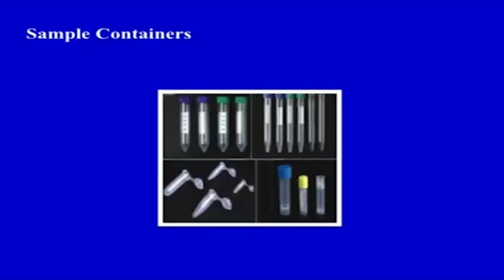All right. The sample containers which are used, like centrifuge tubes or bottles, are manufactured in a range of different sizes, from a few ml to a liter or more, with varying thickness and rigidity and from a wide variety of materials. Sample containers can be made from glass, plastics, cellulose esters, nylon, stainless steel and so on.